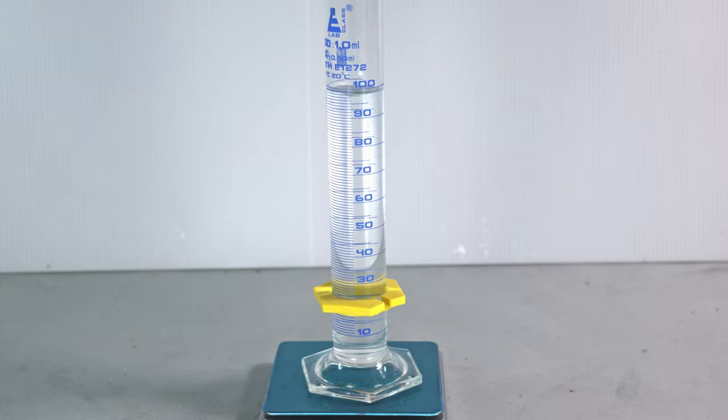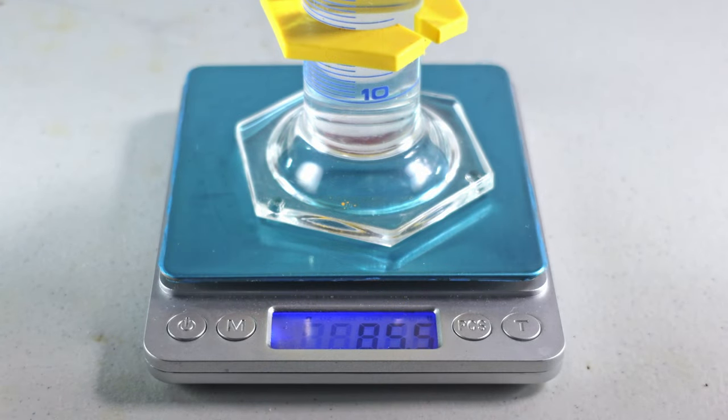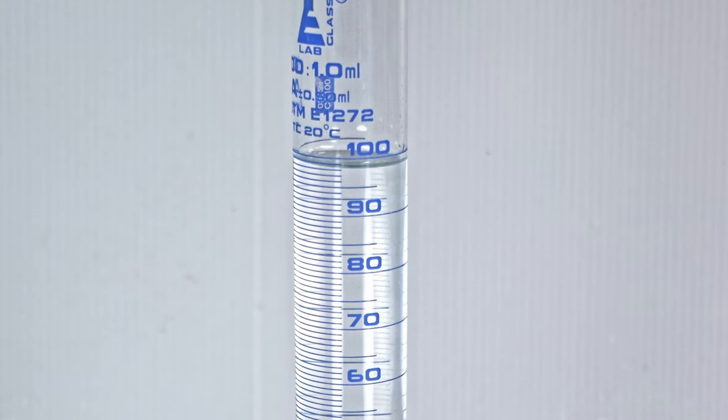As you can see, we're just shy of 100 milliliters. We have 85.5 grams of isopropyl chloride.